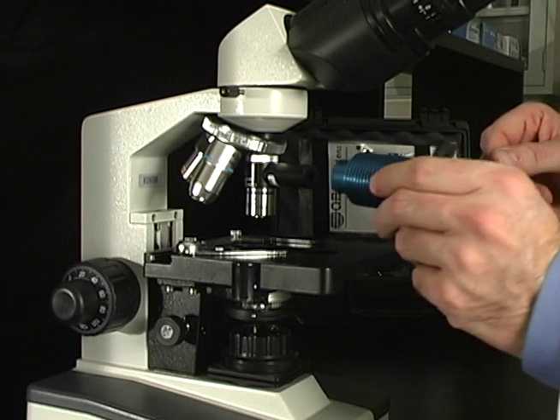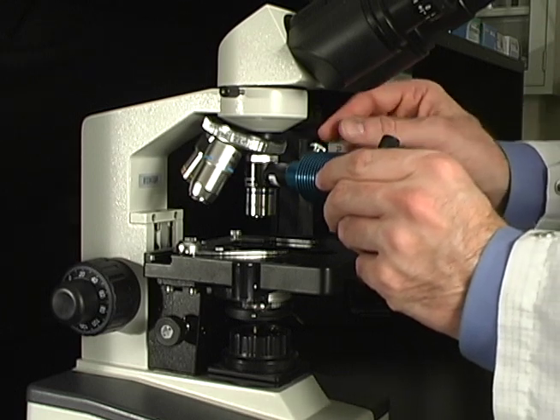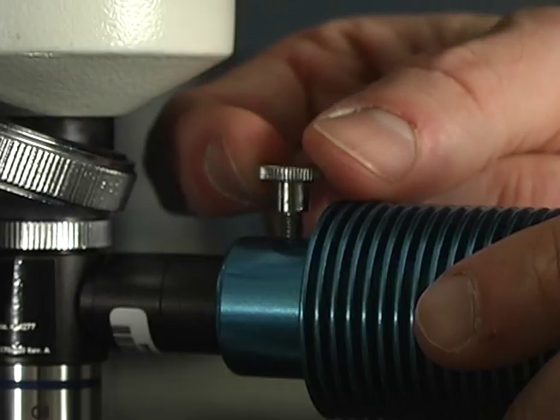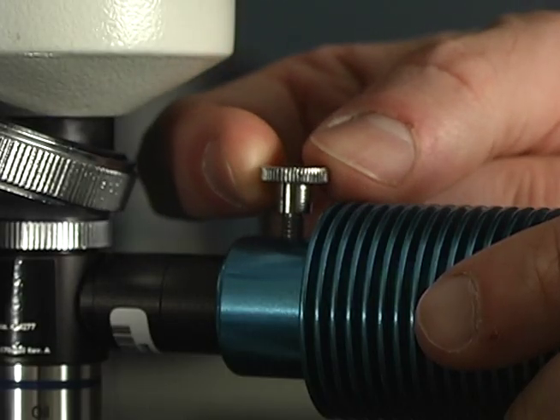Next, attach the blue LED light source by fitting it directly onto the side arm of the assembly. Join these two components together and insert the thumb screw on top to secure them into place.